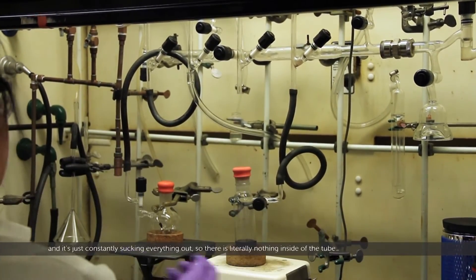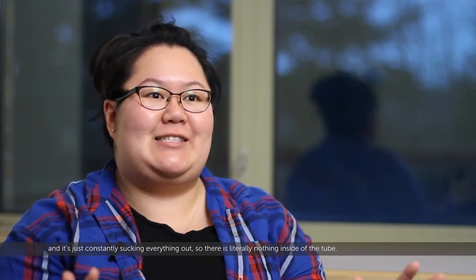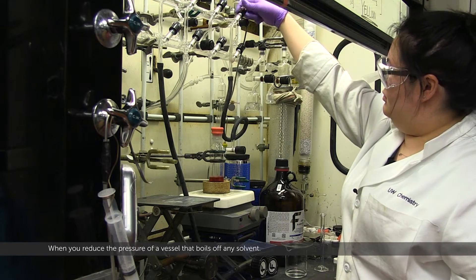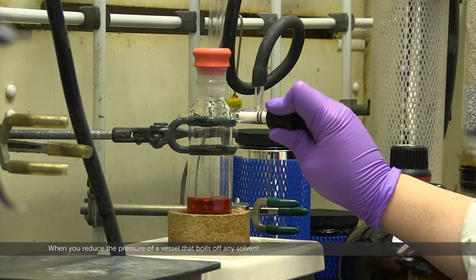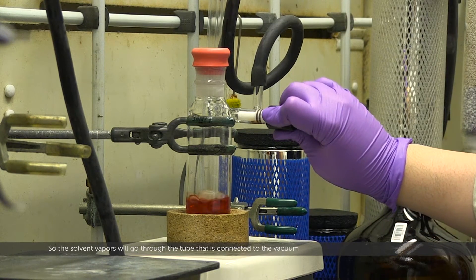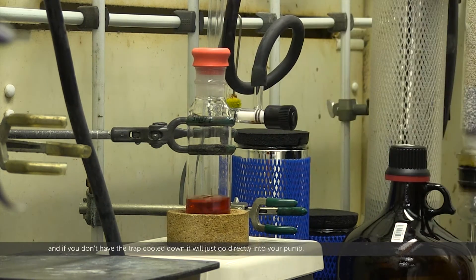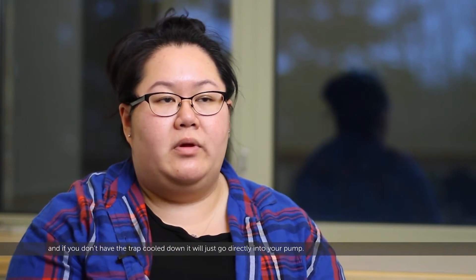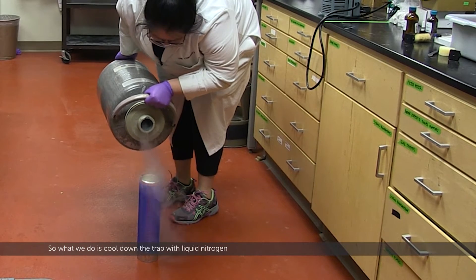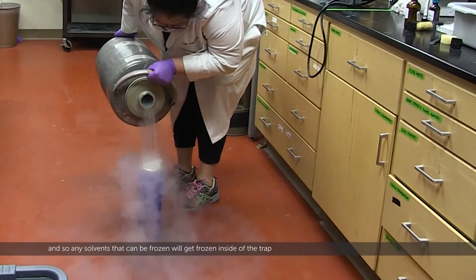The vacuum tube is completely closed off, constantly sucking everything out, so there's literally nothing inside it. When you reduce the pressure of a vessel, that boils off any solvent, and the solvent vapors will go through the tube connected to the vacuum. If you don't have the trap cooled down, it'll go directly into your pump. So we cool down the trap with liquid nitrogen, and any solvents that can be frozen will get frozen inside the trap.